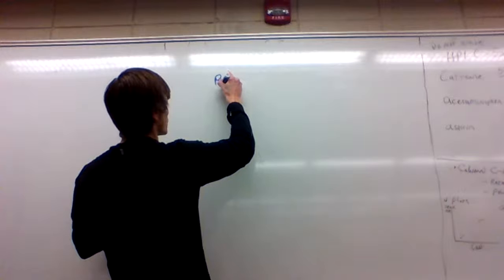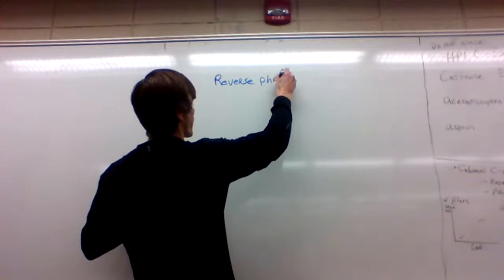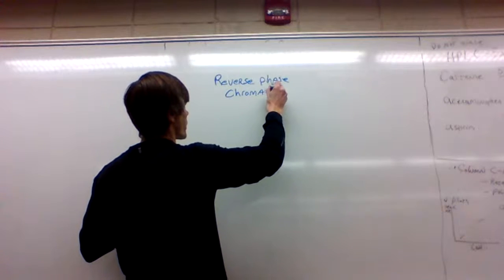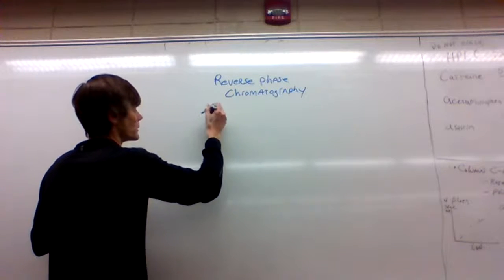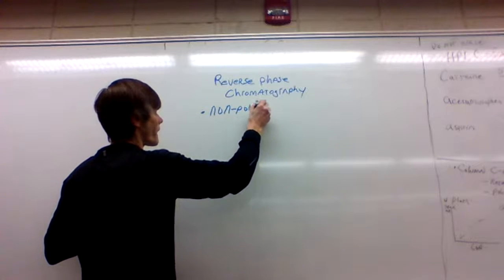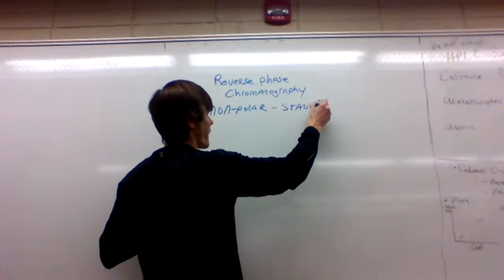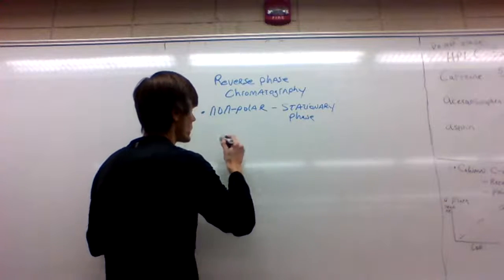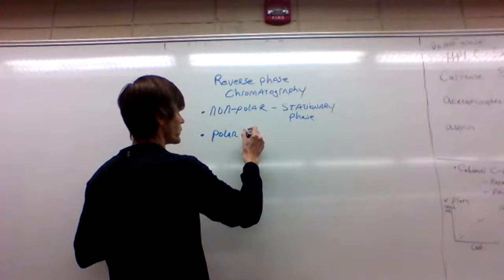Reverse phase chromatography is going to have a non-polar stationary phase, and it's going to have a polar mobile phase.